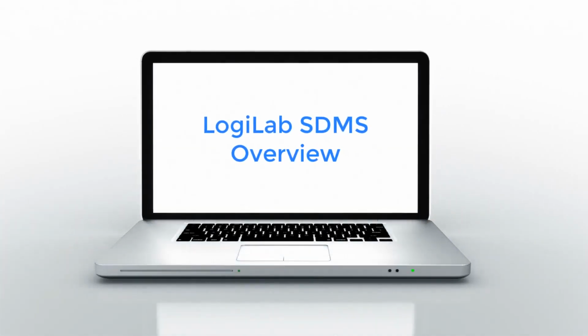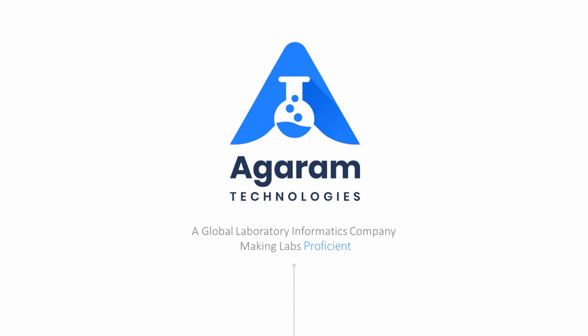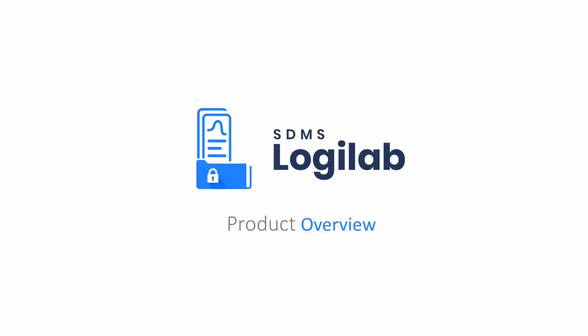Good morning, everybody. Today you are going to see a video on Logilab SDMS overview. This video is about Logilab SDMS product overview. You will be able to see the core functionalities of Logilab Scientific Data Management System.